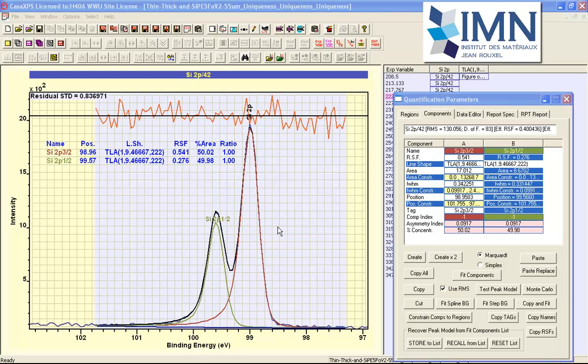However, it's really important to appreciate that what we're doing is effectively optimizing the line shape parameters, and so the shape is being determined by a combination of the residual standard deviation and some physical property. If we do not have a physical property that relates these peaks, and if we don't have data of such high quality and shape that we see here that has guided the analysis, then simply optimizing line shapes is quite a dangerous operation to perform, and even though you can obtain a very good residual, you may not end up with good science.